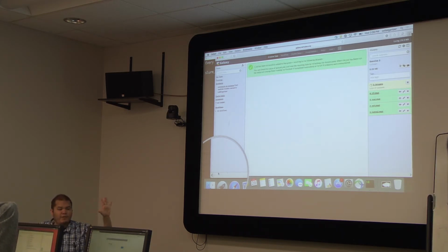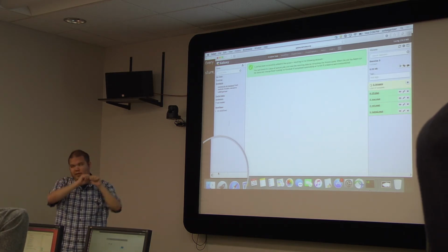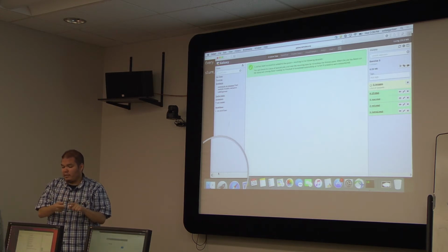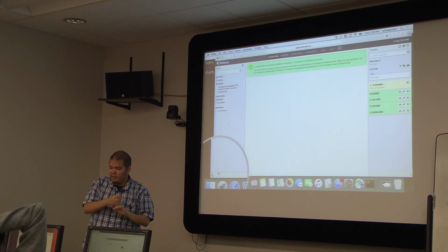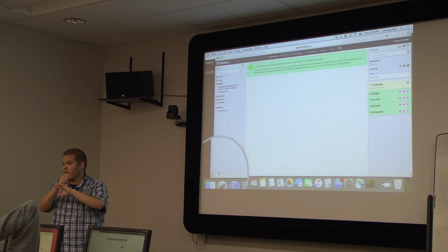So what have we done so far? We trained a classic model with about 50 images, and we got a model back. But that model did not contain protein. So then we imported a canned model that contained a protein, and we synthesized a framework.